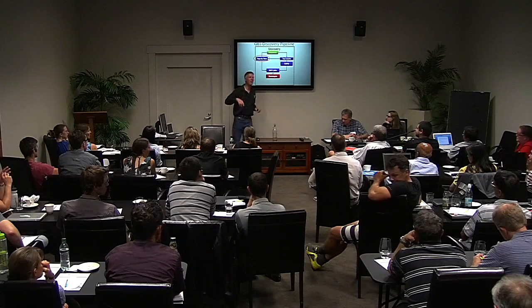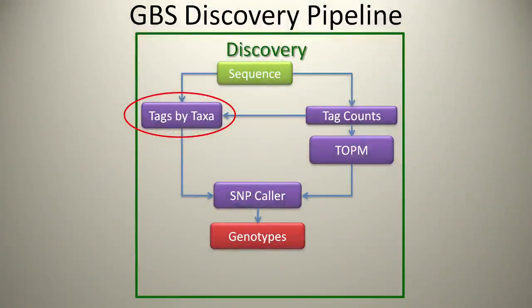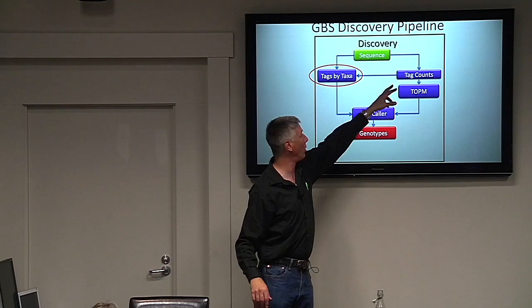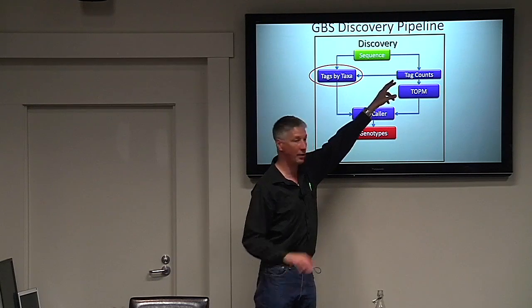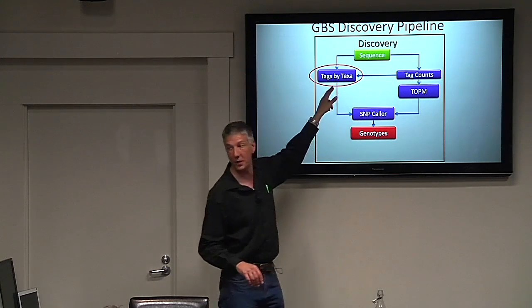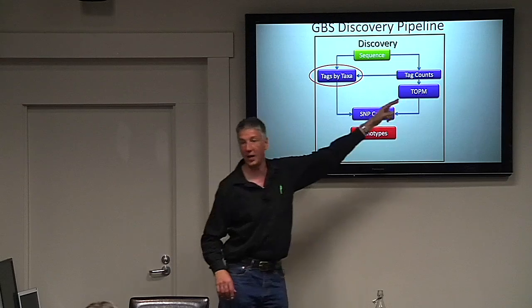Louder. That's right, a minimum tag count. Thank you, Cecilia. Minimum tag count, right? So we're going to try to exclude some of the sequencing errors at that step. So we have information in here about things that are included, and then the stuff that's excluded is not there. So we use this file to inform what goes into this file, because there's no sense in putting things in here that we've thrown away at this step, right?